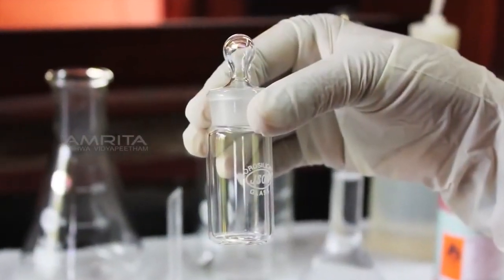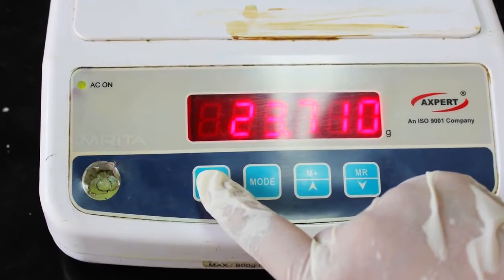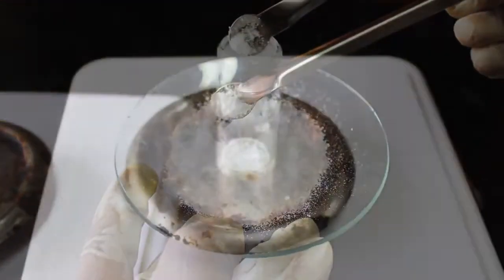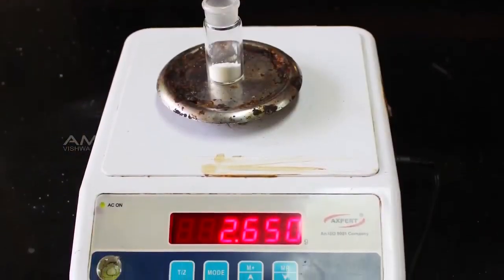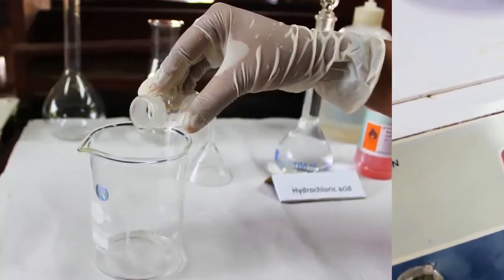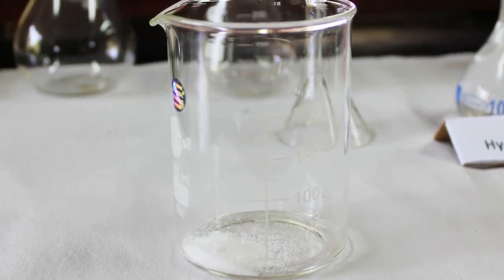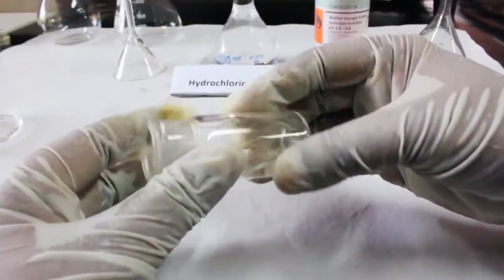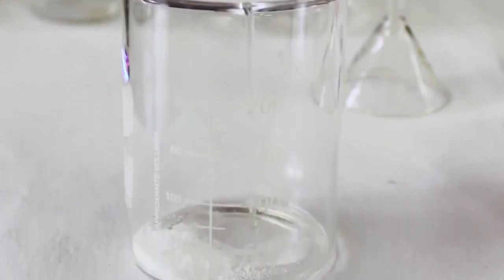Take a weighing bottle and place it on an electronic balance and tare the balance. Take solid sodium carbonate using a spatula and transfer it into the weighing bottle and weigh exactly 2.650 grams of sodium carbonate crystals. Transfer the weighed quantity of sodium carbonate into a 250 ml beaker. Then, wash the weighing bottle 2 or 3 times with distilled water to transfer the particles sticking into the beaker.